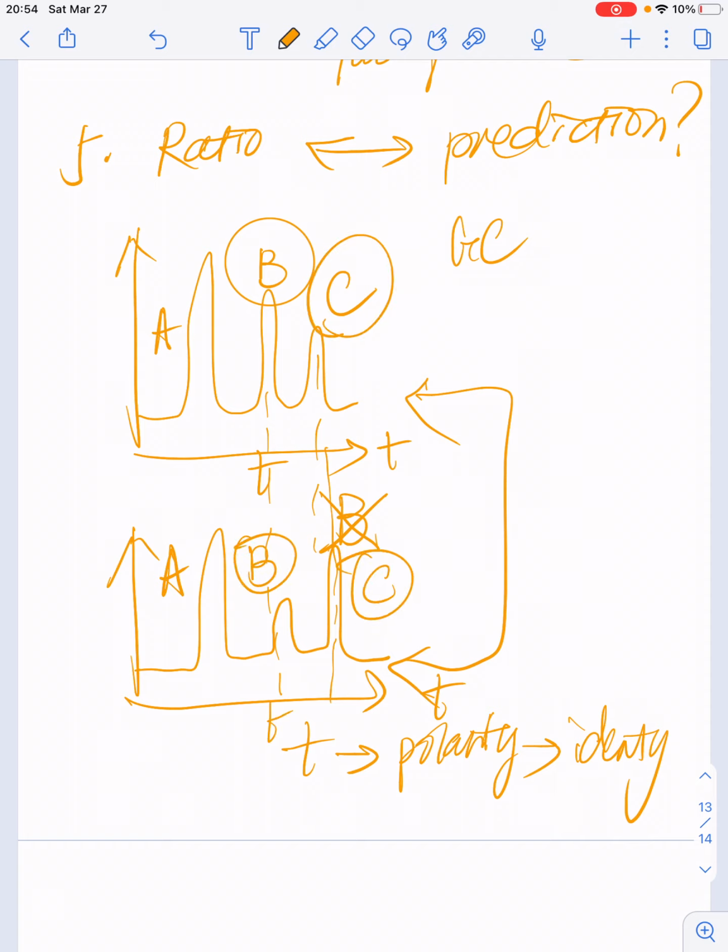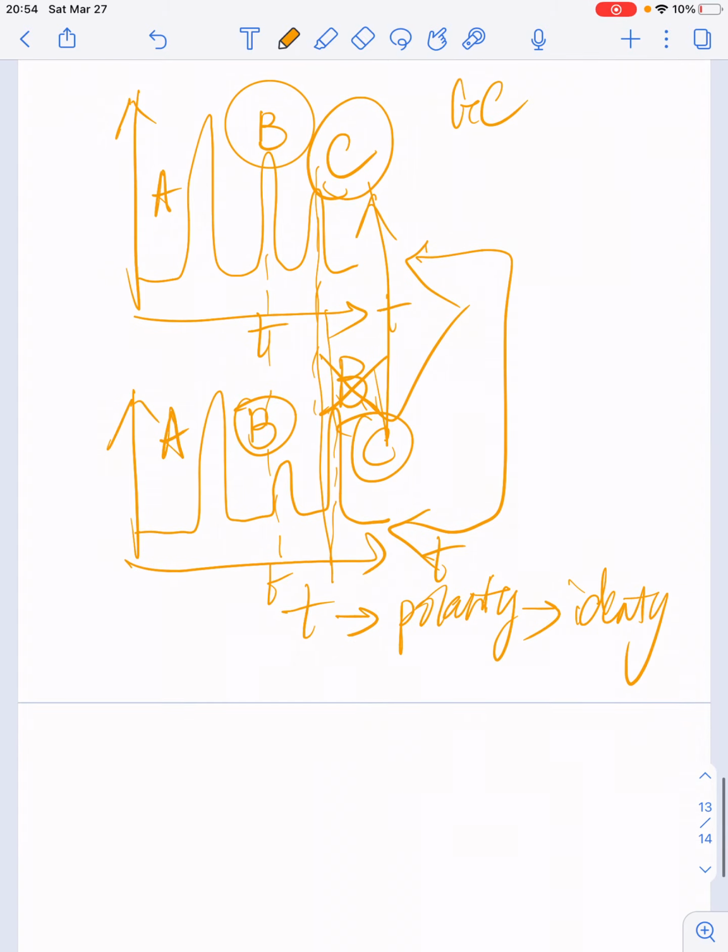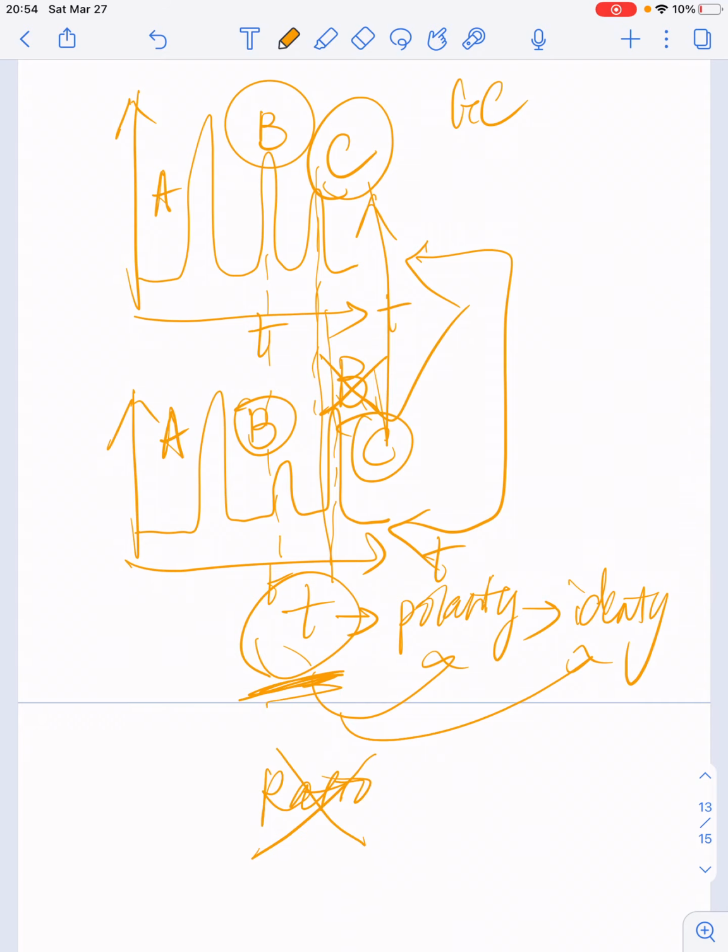If they show up at the same place, they're the same product. Does that make sense? I see a lot of mistakes being made in the post-lab analysis of this experiment, especially. So just a reminder: follow the retention time rather than the ratio, not the ratio, only the retention time.